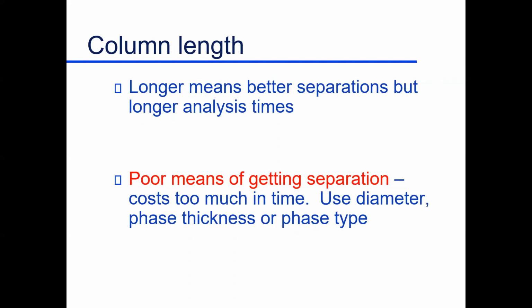Well, back in the old days when chromatography first came about, they were dealing with 6-foot columns. They were made of solid glass. Well, not solid. There was a hole in the middle. So, okay, glass tubing. They were about 6 feet long. Today, most of our columns are 25 meters, 50 meters. We even have a 100-meter column if it's rolled up and put inside that instrument for separation.